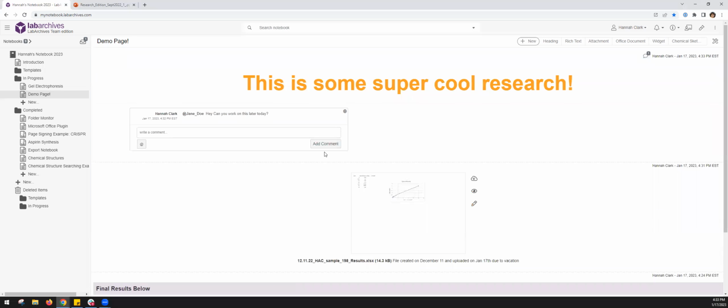Now, we'll talk more about our activity feed in just a second, but you'll see that comment has been made. I can go up to the bell icon, and here's where I would have a notification. Oh, someone have a question there? I think we have a couple, Anna. Okay. Yeah, so there is one from Serena, a very good question.